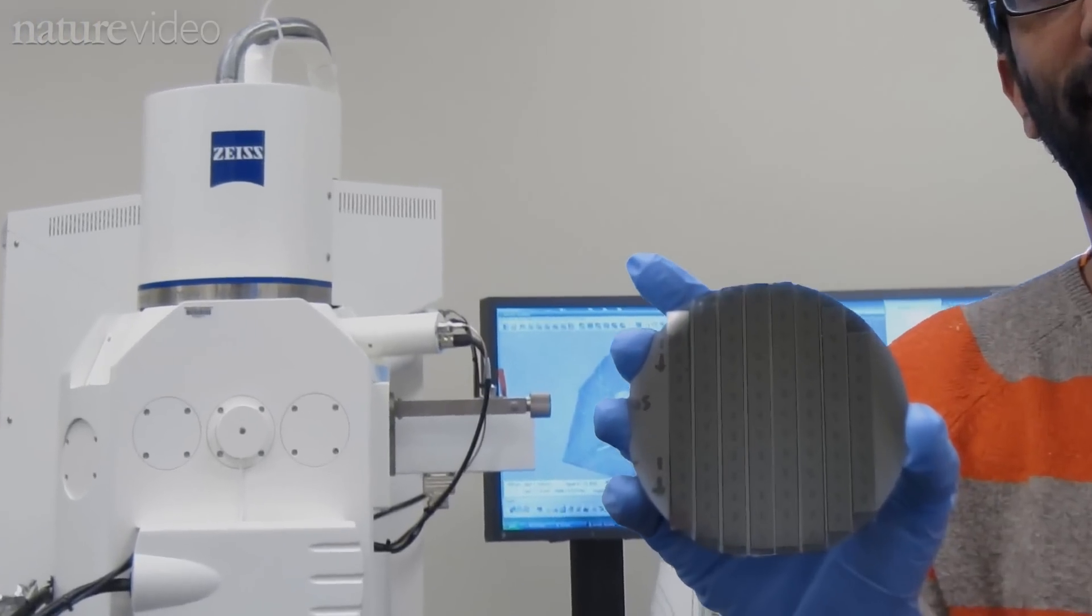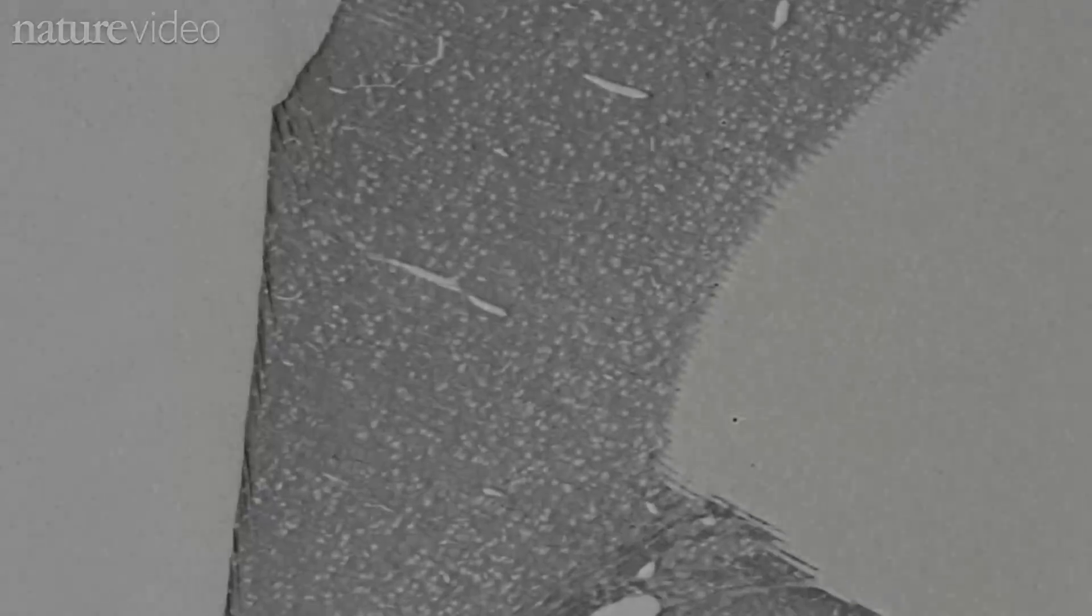To do the study, a Harvard team used a machine to cut a piece of mouse cortex into thousands of wafer-thin slices, which they stuck on a ribbon and scanned.